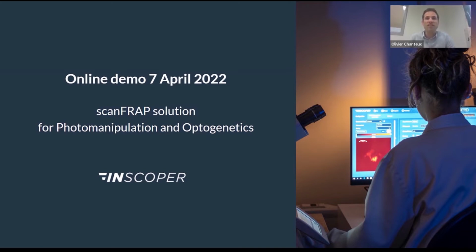I am Olivier, Sales Manager at Inscoper, and I'm pleased to present you the new scanFRAP solution. I have a few slides to show you before meeting my colleague Julien at the microscope. During the whole presentation, feel free to write your questions in the chat. They will stay anonymous and we will answer them after the demo.